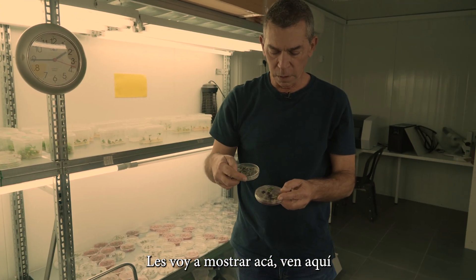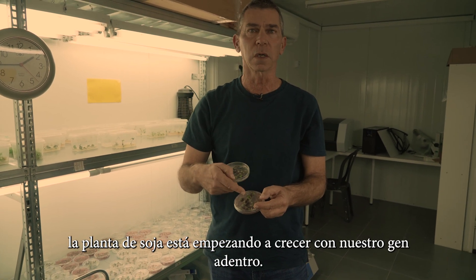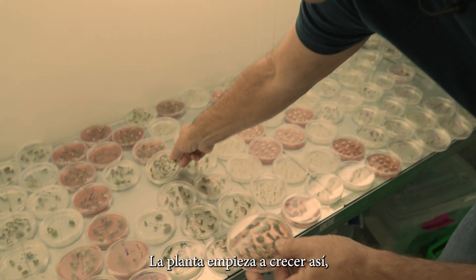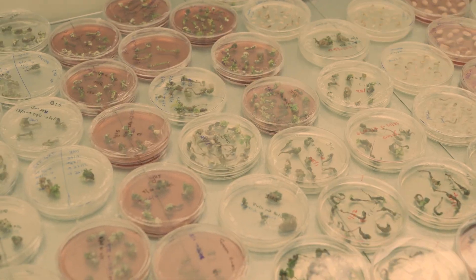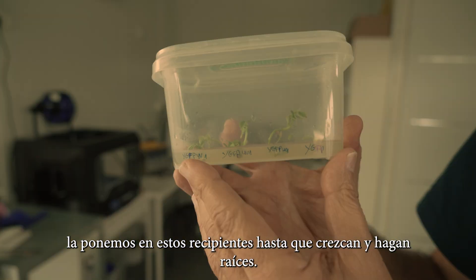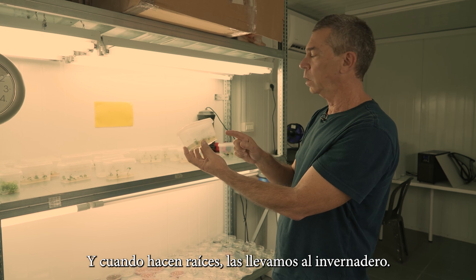You see here soybean plants starting to grow with our gene inside. Only a few will grow here with the gene because we apply selection. The plants start growing like that here, and then when they grow more, we put them in these boxes until they grow and make roots. When they make roots, we take them to the greenhouse.